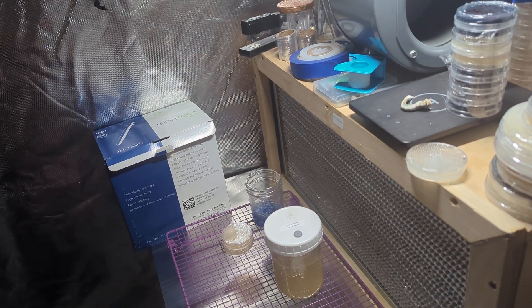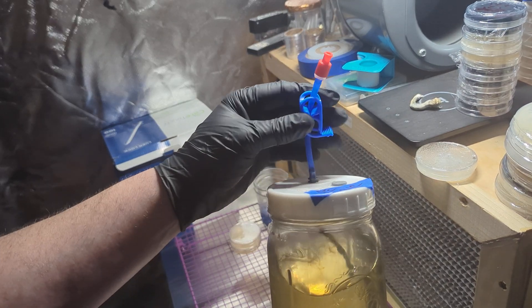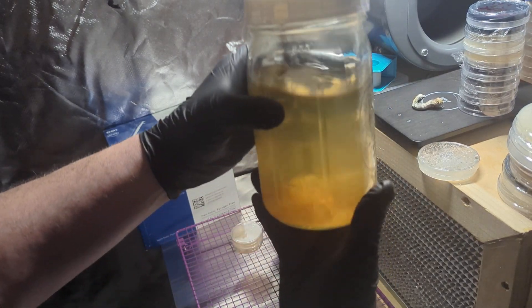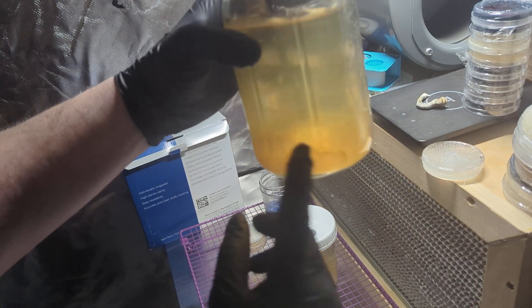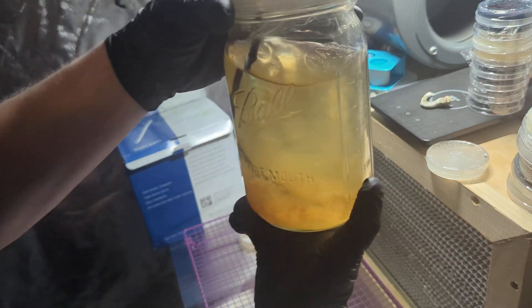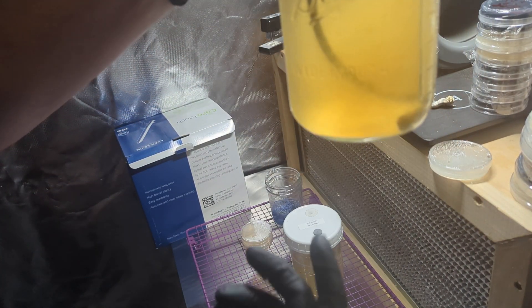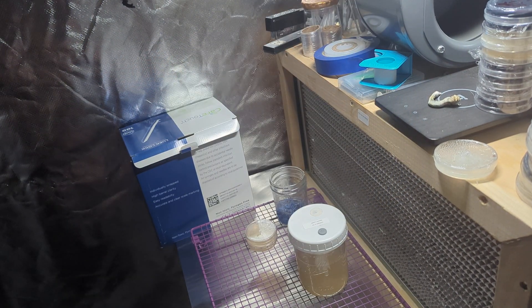I also have these handy dandy jars I'm going to be trying out. These are from MycoFruits — you can find them on Etsy. This one is not yet ready; there's a cloud in the bottom, still a lot of nutrients in here, you can see it's still tinted. I'll get it swirled up and this should be ready sometime soon.